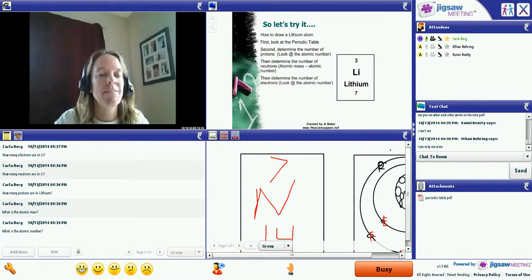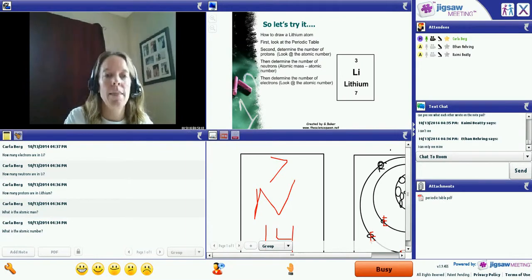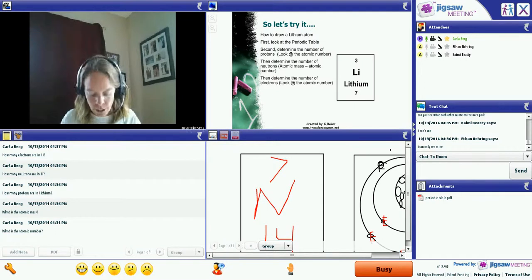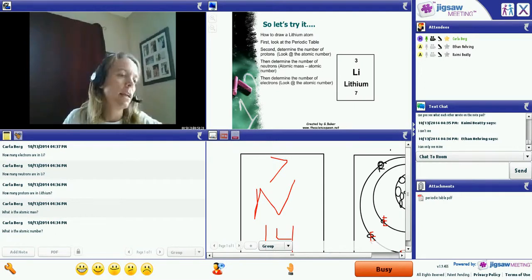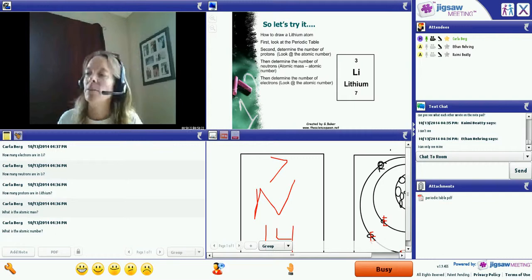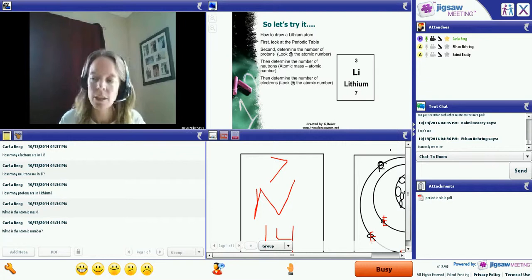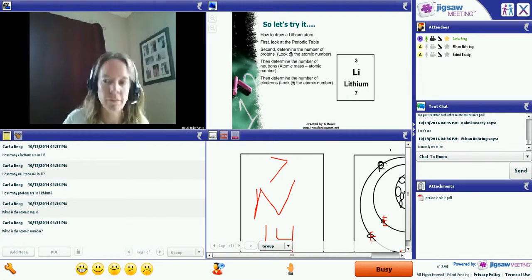Put your lab safety goggles on, and then click yes when you have your lab ready to go. Okay, so just click it once you have your reagents out, your glasses on, your well plate. You are going to want to have some distilled water near you just in case you need it. Make sure you have everything.